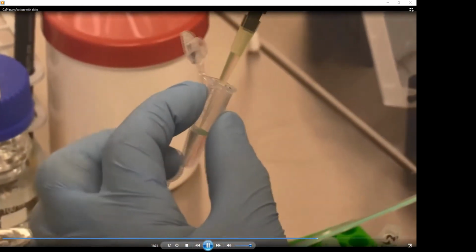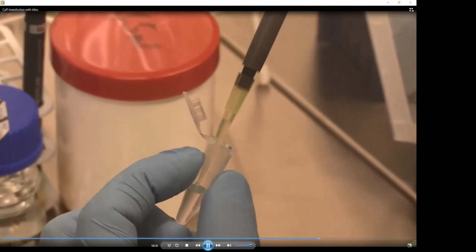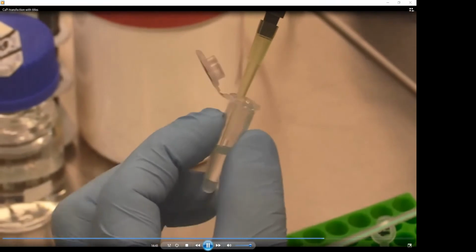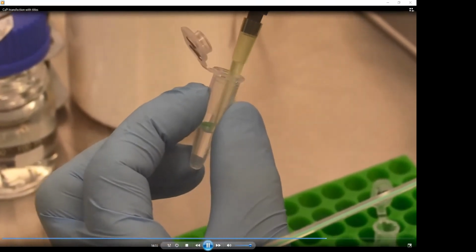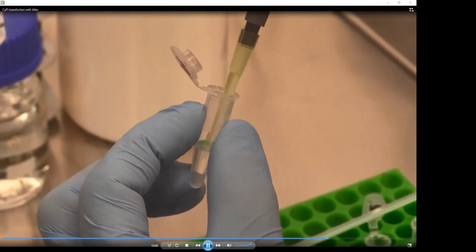So I'm showing it in detail because you have to be really careful to collect all the solution which you have prepared. It has to be in a 1-to-1 ratio. And here you have a small advantage over the normal course because you can see everything in detail. When there are many participants in the course and only one is pipetting, the rest has to watch it and it cannot be so nicely visible as in the zooms of the video.